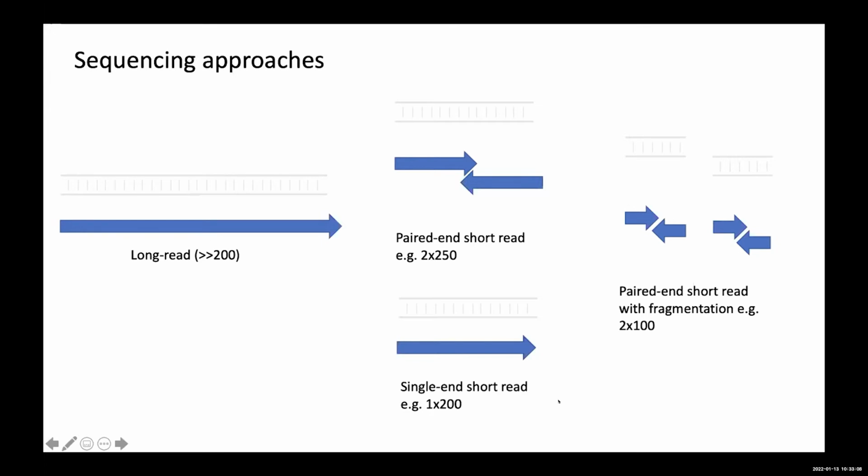So you need to make sure that your library is able to be sequenced either with an overlapping paired end mode for amplicon sequencing, or to completely cover the amplicon using single end. So this defines the fragment length, if you like, and obviously to do that you might need to add in some additional fragmentation. So if you start with an amplicon size that's too long for your sequencing run mode, you then might need to optionally add in a fragmentation into the library prep.